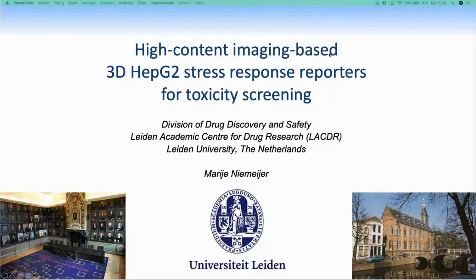Thanks. So yeah, thank you for giving me the opportunity to present here in this session. My name is Marije Niemeijer from Leiden University, and I'm also working within the PATROLS project. Today I will present a 3D HepG2 stress response reporter, which is imaging based, to enable nanoparticle toxicity screening.